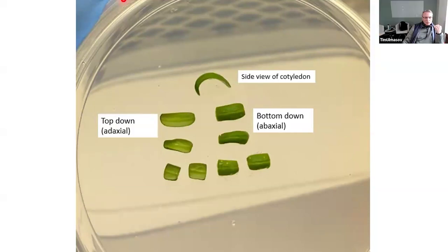And how many circles around the plate? Oh, just once. Just once, okay. Just once. Yeah. All those little things can make a difference, can't they? It's just the one thing with tissue culture, and people say, oh, that can make a difference. And I always say that's where you're going to fail with plant tissue culture, because in my experience it's just the littlest things that you might not think would make a difference. They can. Yep. Thank you.